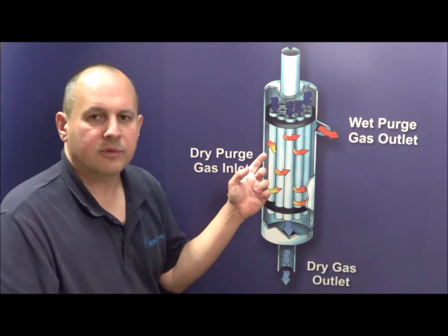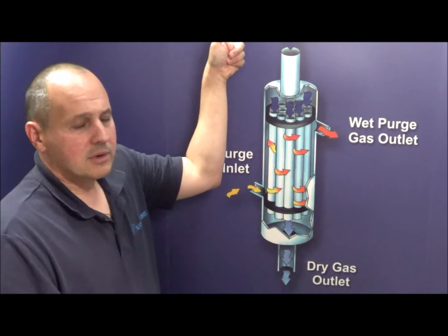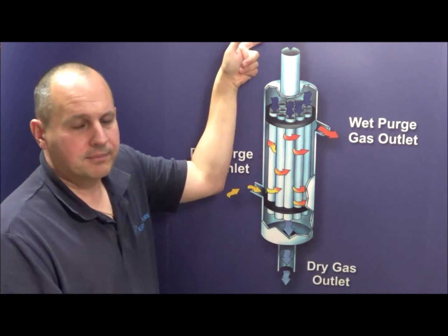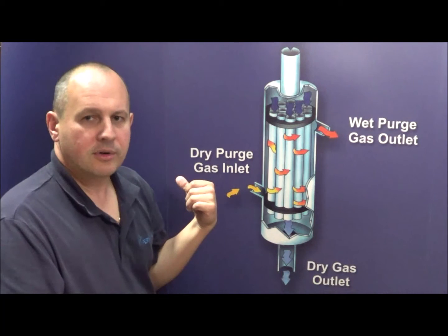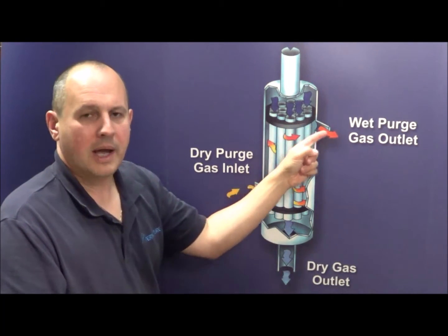This diagram shows basically how all of our dryers work. Your wet gas sample enters through the top and exits through the bottom dry. A dry purge gas enters from the bottom and exits from the top wet.